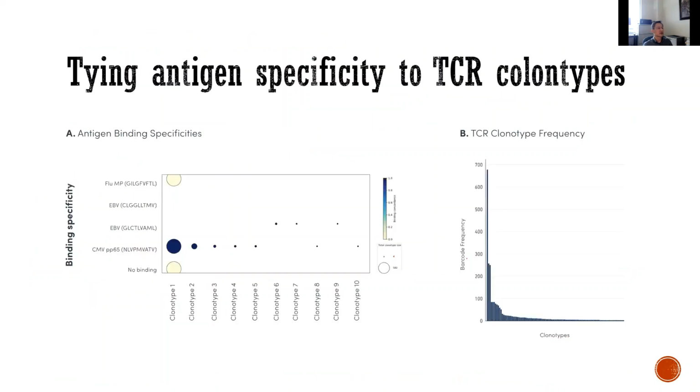So it's very useful. And number one, you can have a frequency analysis. Look, this clonotype 1 is the most abundant. You know the frequency is high. And then another clonotype will have a lower frequency. So if you compare this frequency between two conditions, such as before and after infection, you may realize, okay, particular clonotypes have been disproportionately amplified. That gave you information that this clonotype, containing this combination of alpha beta chain, may be very special for this infection-provided antigen.